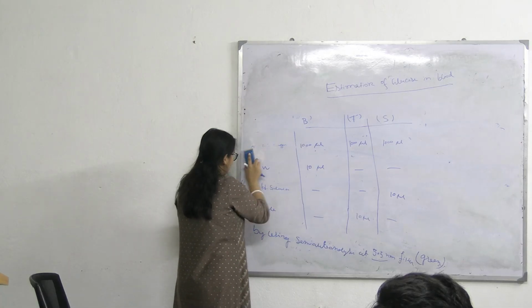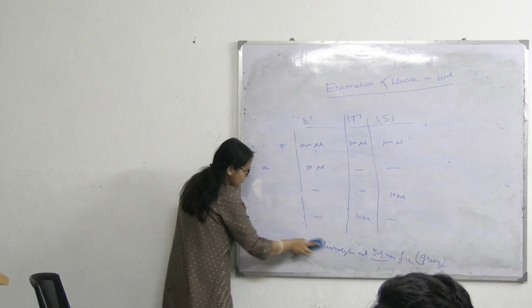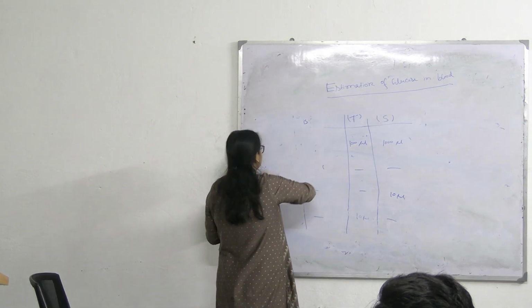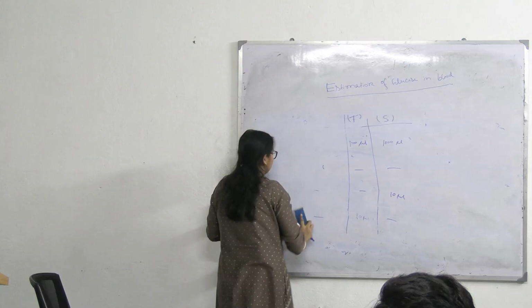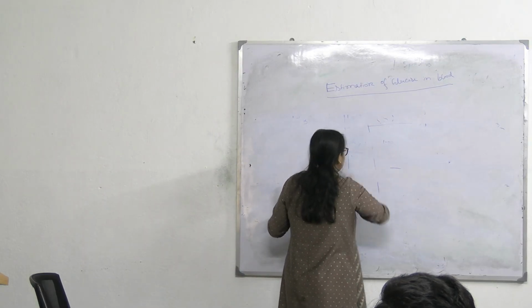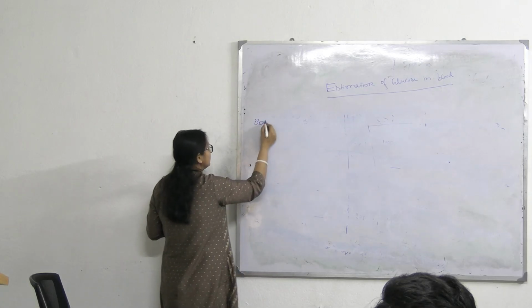Now observation. So we will get 3 sets of absorbance values from each test tube. So the next point is observation.